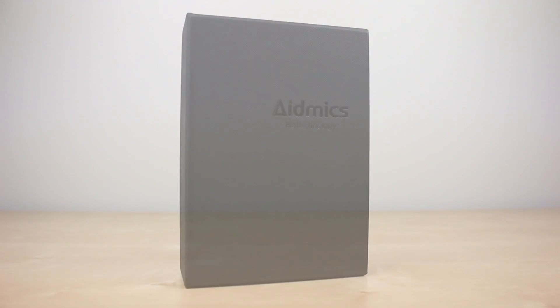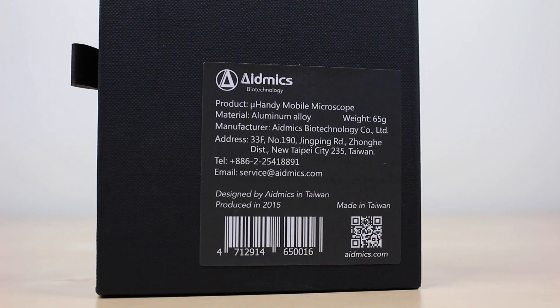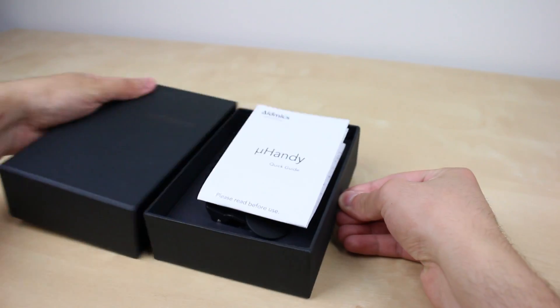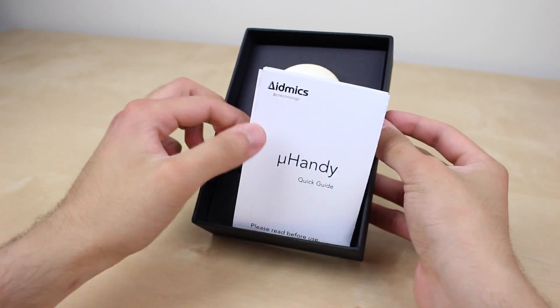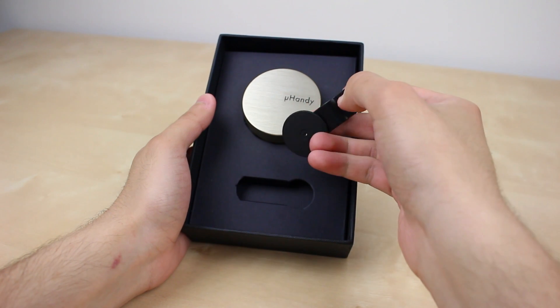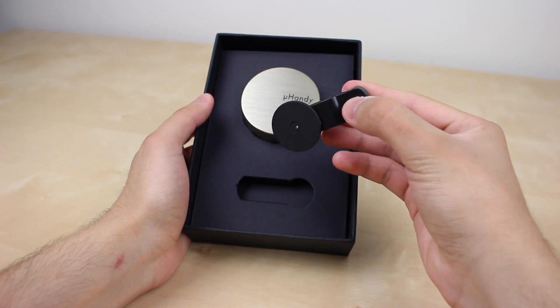The U-Handy retails for $200 and you can also get a $20 custom case for your device if you want to attach it that way, but it is optional. Inside the box it comes with a quick guide that has instructions on how to use it, and it includes a lens clip to attach the U-Handy to your device if you don't have or want their case.